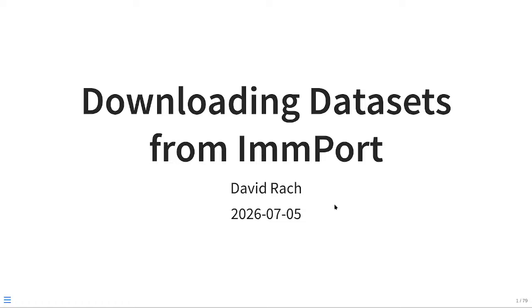So for this particular walkthrough, I'm going to show you how to download datasets from ImmPort, namely the dataset that was used during the week 12 through week 14 part of the Cytometry in R course, working with the full, entire FCS files rather than the small downsampled FCS files that were actually included for the course.